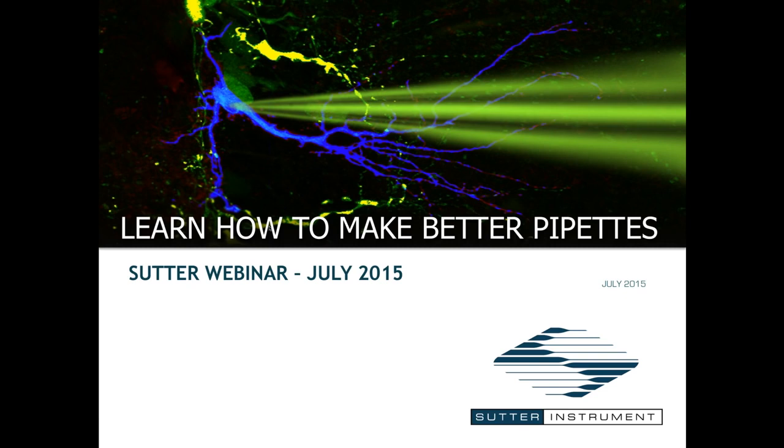Okay. So you can loop sometimes even 6 times with the thick-walled glass to pull a larger patch pipette, but you're going to introduce some more variability because you're really at the threshold of having a sufficient amount of glass before the last stage of pulling to actually make a good tip. You're going to go from those pretty pipettes to those pretty ugly pipettes, and you don't want to do that if you loop too many times. So here, I'll show that to you again.